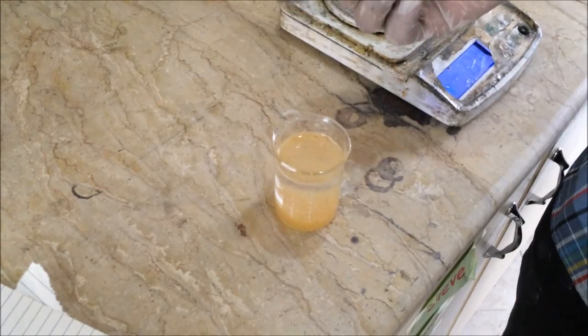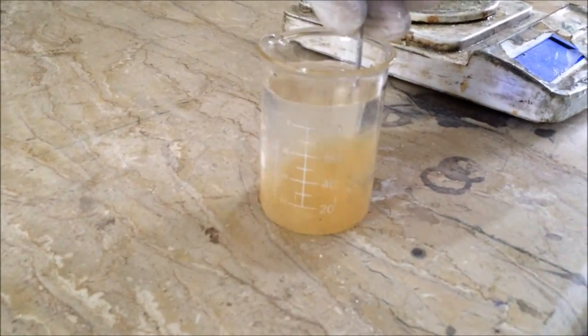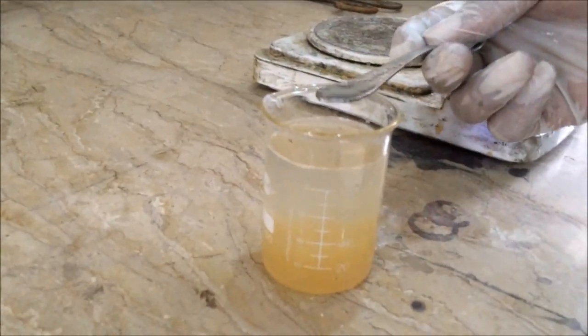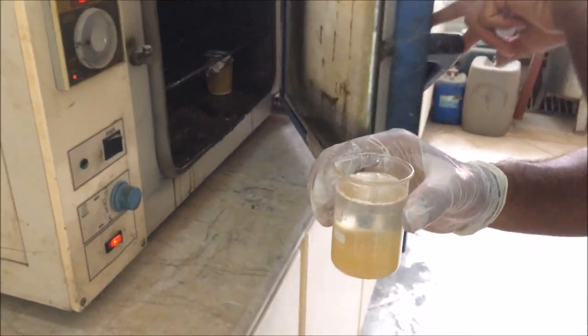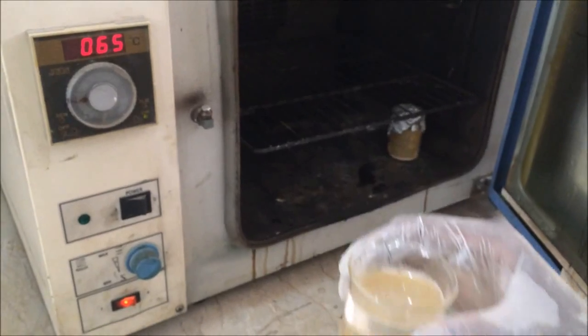Now we will use a stirrer to gently stir our solution. Our solution is ready. Now we will place our beaker into the oven, which is already maintained at 65 to 66 degrees centigrade, and we are placing our solution into the drying oven.